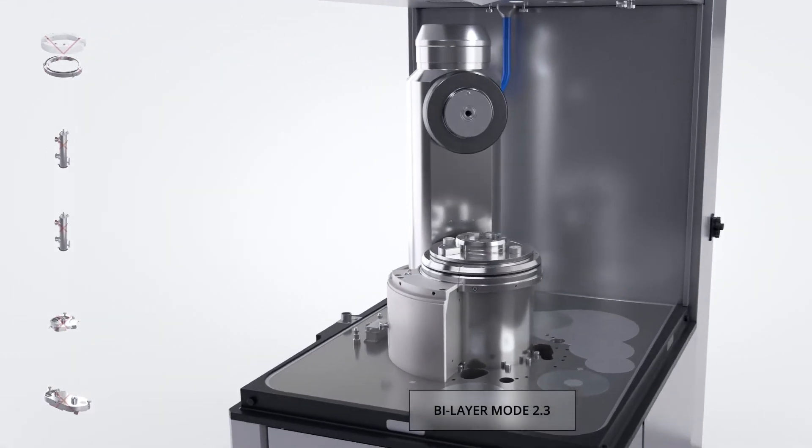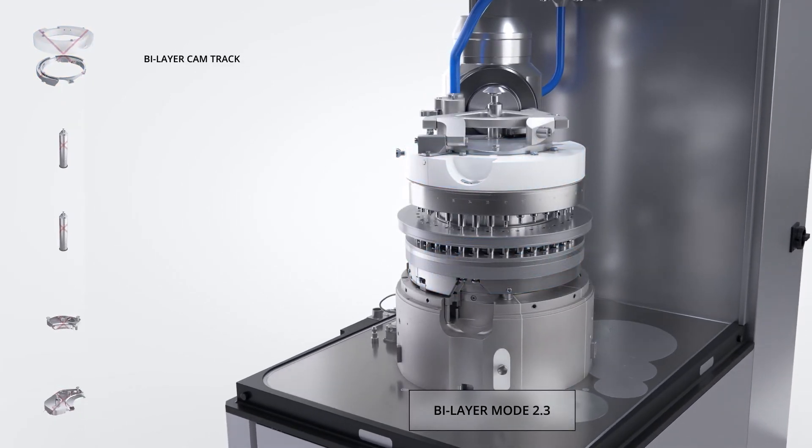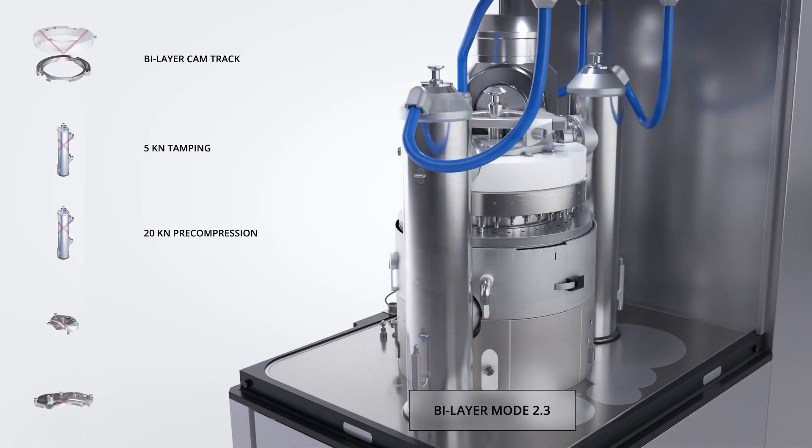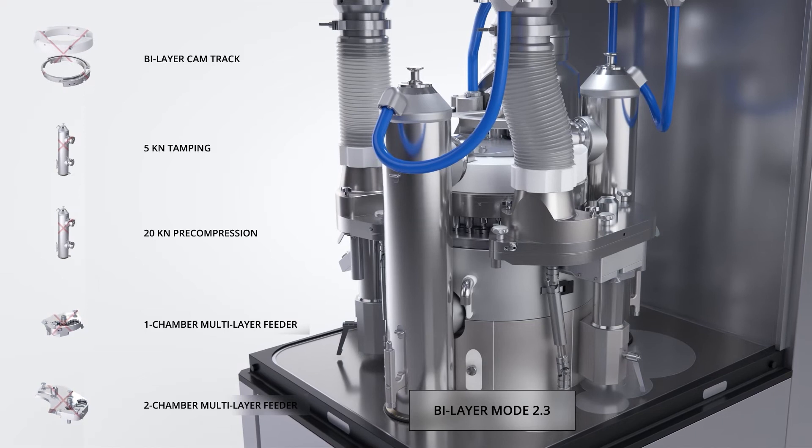Bilayer mode 2.3 is ideal for those bilayer products where the heavier layer is in layer 2, or where the layer 2 material has marginal flow properties and where pre-compression on the final tablet is desirable.